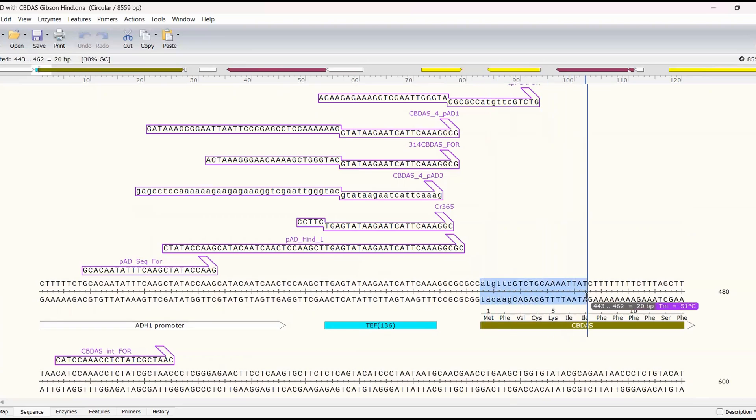So we can walk out our selection and what I'm looking for is that TM in the purple to reach 57 because that's typically the melting temperature that I like to use. So this melting temperature now says between 56 and 57 but the length of this primer is 30 base pairs so there's a lot of problems with this primer based on what I told you in the notebook but again when you're designing primers in the real world nothing is going to be perfect.